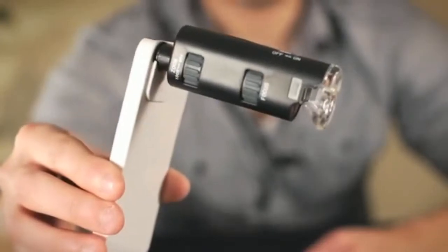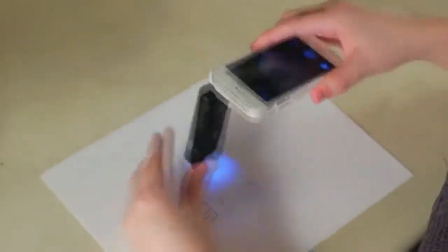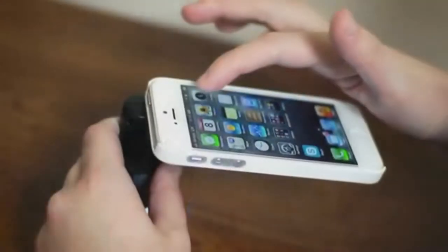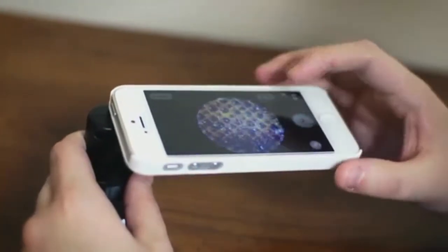Hey, what's up guys, this is Doug from Carson Optical and today we're going to be going over one of the coolest and newest innovations for your iPhone, the Micromax Plus. Microscopes are way too bulky to carry around, but now there's a device that gives you the ability to see up to 100 times closer than the naked eye and still fit right in your pocket. The Micromax Plus is fun, educational, and turns your iPhone into a super sleek microscope.